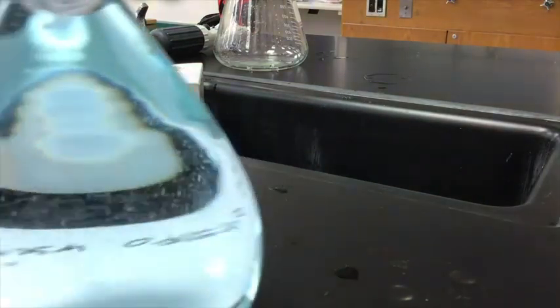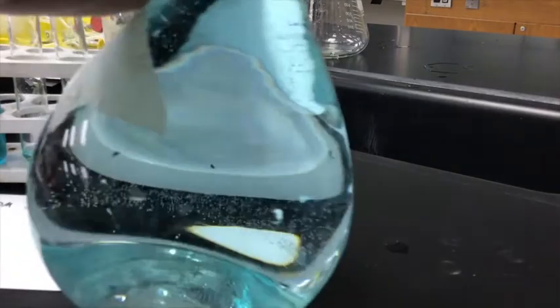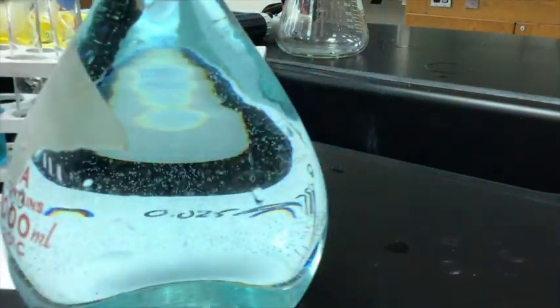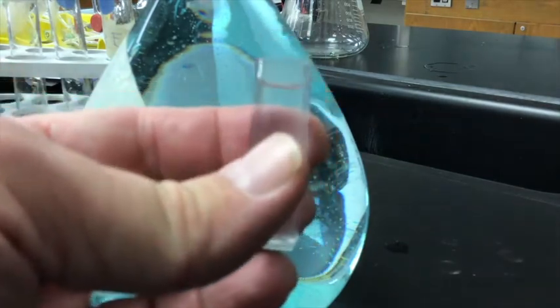Again, I'm just taking from my solution that I made from the brass screw that was there. And dump it. And then take my unknown that's here, fill her up. So there we go. So this is now completely filled with my unknown that I made.